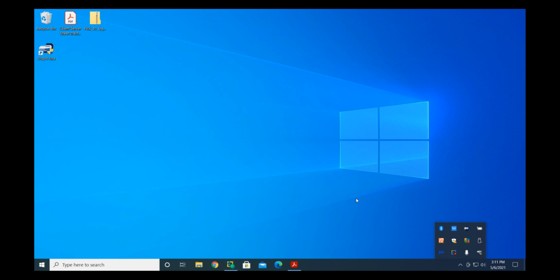For all the workstations and all the setups for client server, all the communications are being done through port 3306. So 3306 is the default port for the MySQL setup database, and sometimes you will run into the odd issues because some antiviruses come with firewalls. So you'll have most of your workstations connecting properly to the host, getting the information, and then you'll start Dispill on another workstation, you'll get connection to database failed.